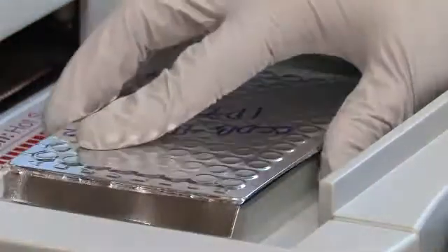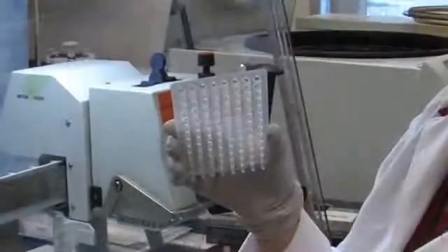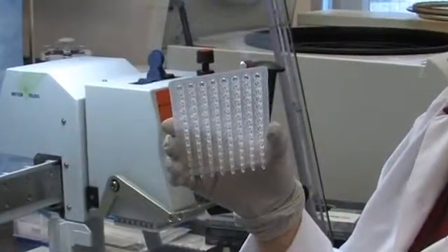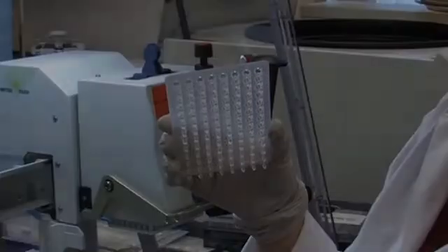Following centrifugation, the plate is placed into the PCR machine for amplification, completing the cycle sequencing PCR setup. This high-success plate processes 90 samples and goes straight into the sequencing reaction.